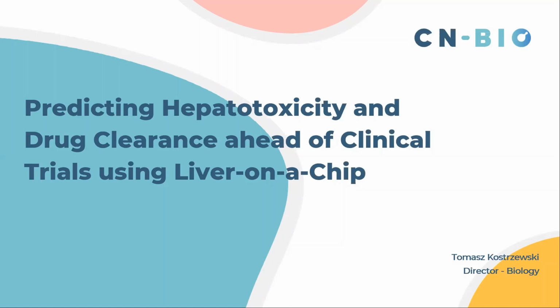Thanks, Brian, for the introduction. Hello. So today I'm going to tell you about how we use our liver on a chip technology to predict hepatotoxicity and understand human drug clearance.